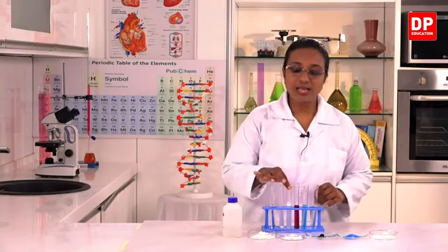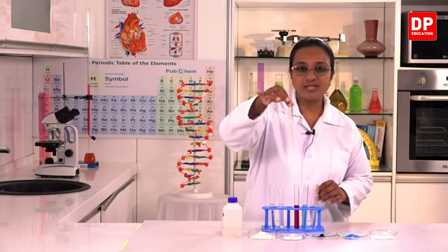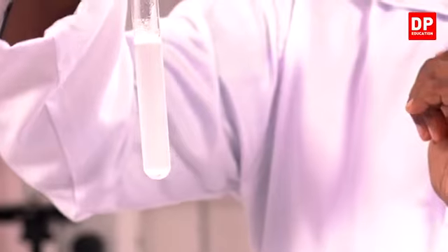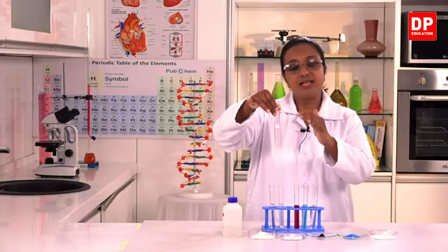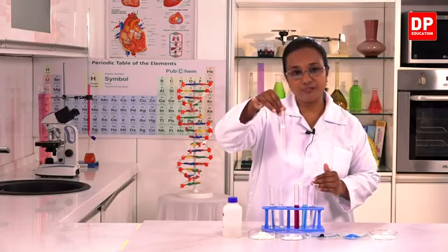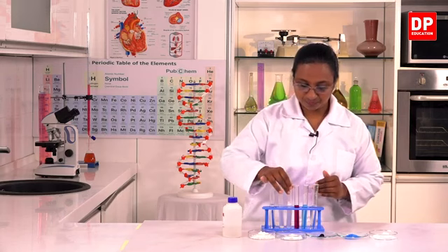Then we have the next one, that is washing powder. Here you can see, students, at the top you can see the foam. Here the solution is almost clear, but towards the bottom you all can observe that there are particles remaining. That means the transparency and the color are not uniform in this washing powder mixture.